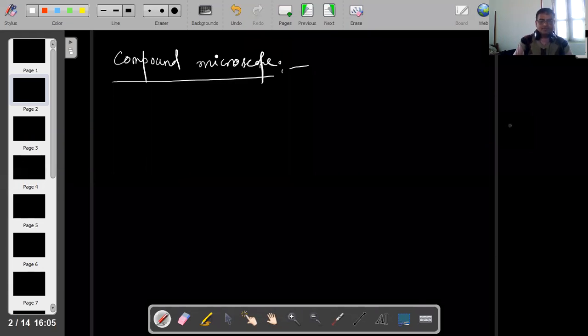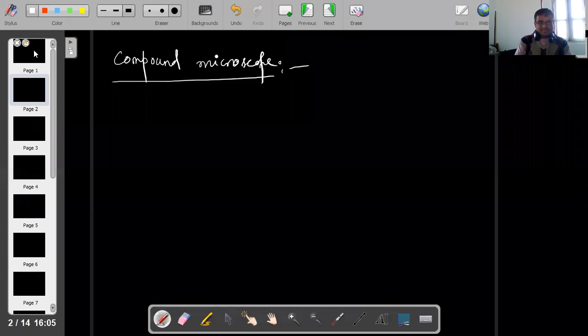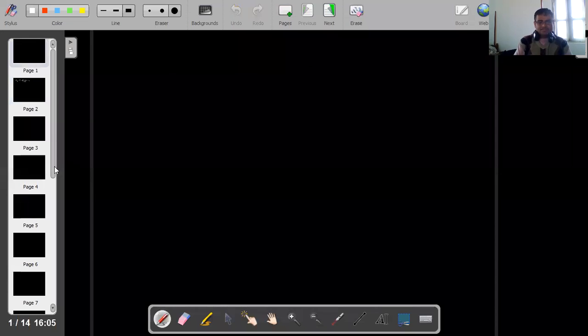Clear? Microscopic means very small objects.